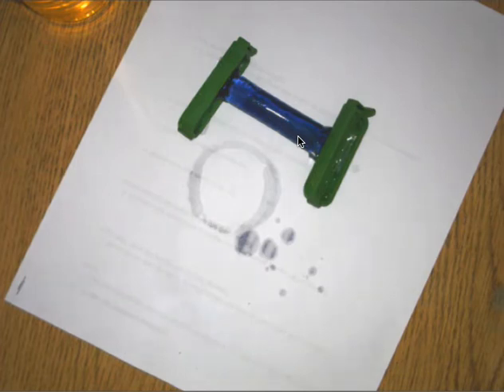Is glucose present? Well, what do we know about diffusion? Diffusion or osmosis will happen until what takes place? It'll continue to happen until they're equal. So, if we had glucose in the beginning, should I have glucose in there now? Yes. Is starch present? Well, what do we know about iodine and starch? Yep, so therefore we know that there is starch present in there, and we know that iodine is present as well because it turned the starch color.